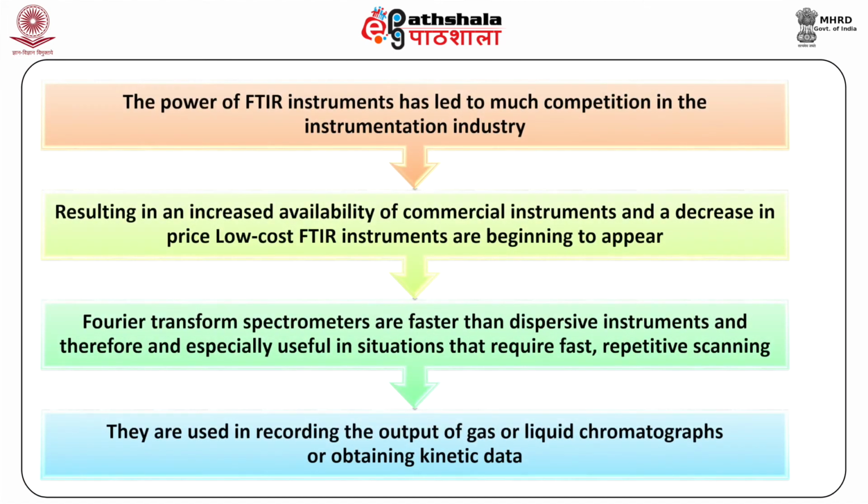The power of FTIR instruments has led to much competition in the instrumentation industry, resulting in an increased availability of commercial instruments and a decrease in price. Low-cost FTIR instruments are beginning to appear.